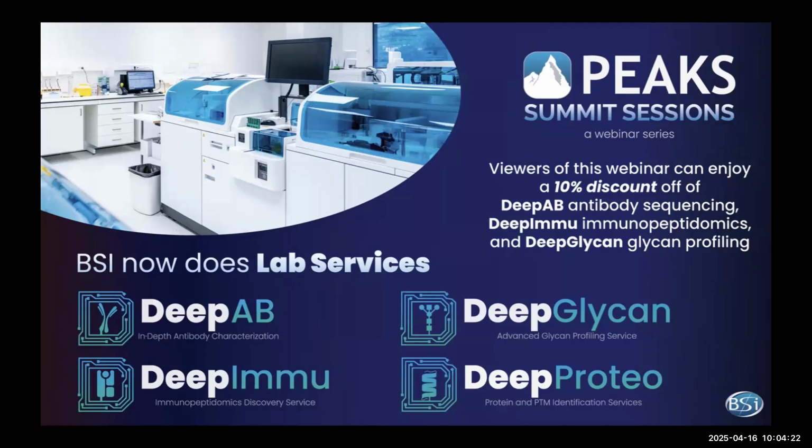Ching will be sharing a powerful and innovative workflow that combines DIA and PRM fully integrated in a single seamless solution using Peaks. Whether you're navigating large-scale discovery or zeroing on sensitive validation, this hybrid workflow offers the best of both worlds without compromise. From deep proteome coverage to precise quantification, you'll learn how to harness the full power of hybrid DIA, developed by Professor Jesper Olsen's group and Thermo Fisher Scientific.